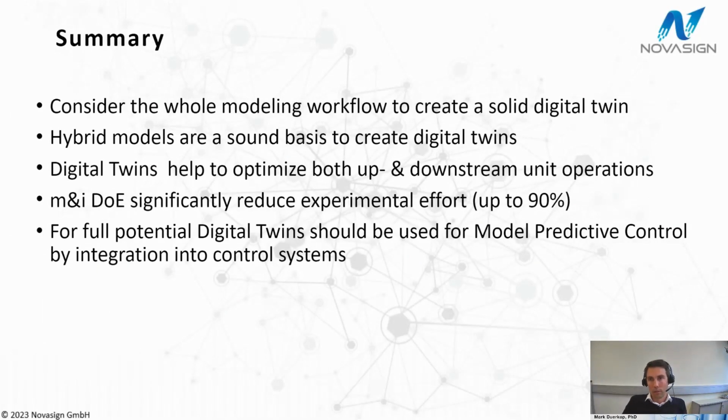So now, in order to conclude my talk, whenever you talk about digital twins, it's important to consider first what a digital twin is and what it should deliver. Digital twins are anything and nothing. They for sure have a very high potential for the future. You just have to really consider what it should do and how you get there. In order to do that, consider the whole modeling workflow rather than just talking about a very fancy process modeler.